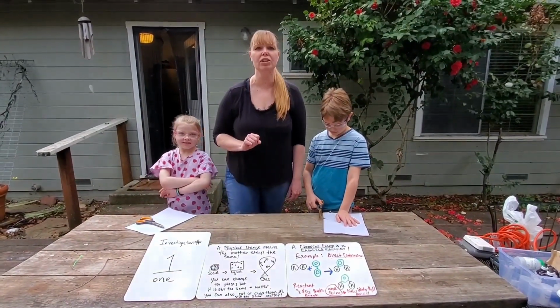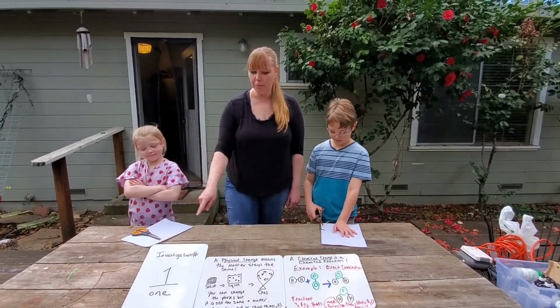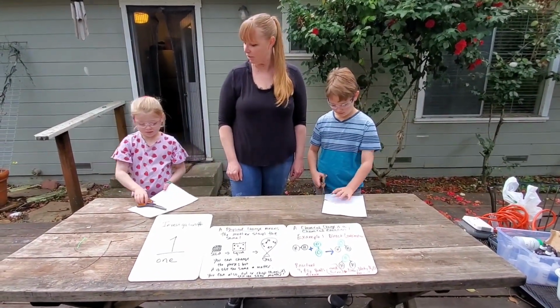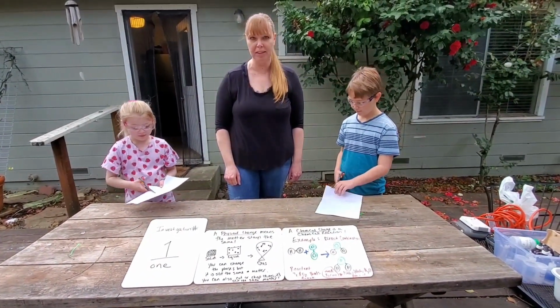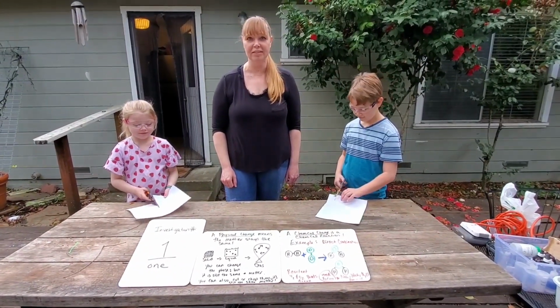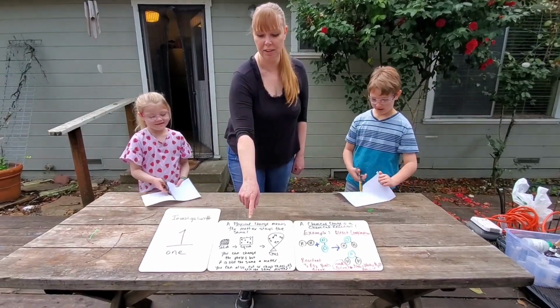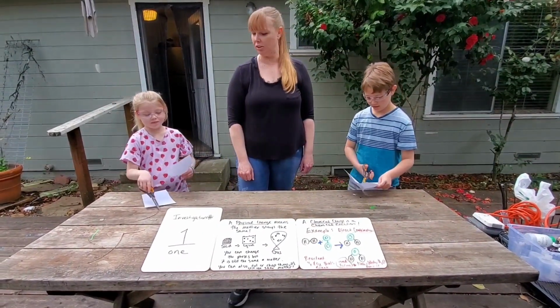This is lab investigation number 1. So keep in mind, is it physical or chemical? Go ahead, Joel, show them the first ones. Real basic. What are they doing? Cutting the paper in half. So as they cut the paper, is this a physical or a chemical change?